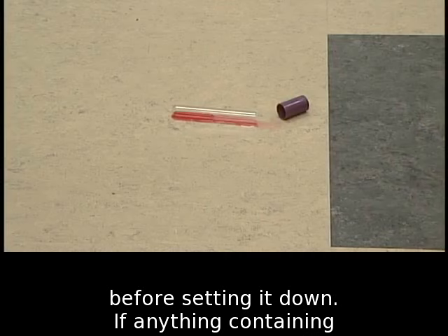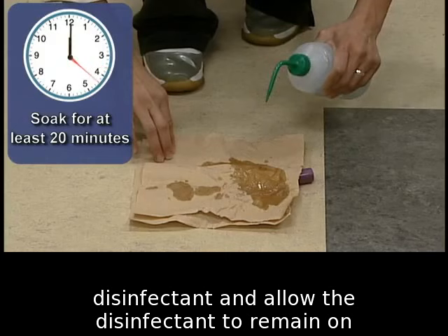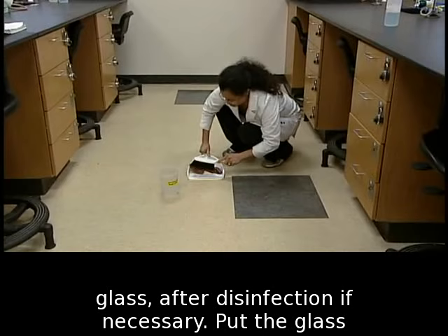If anything containing bacteria spills, cover the contaminated media in glass or plastic with a paper towel. Soak it with disinfectant and allow the disinfectant to remain on the spill for at least 20 minutes before cleaning it up. Use a broom and dustpan to collect broken glass after disinfection if necessary.